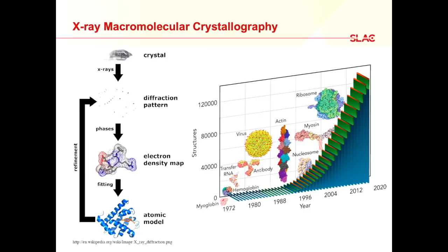This can be a tedious process, trying to take a protein and crystallize it. It does not always work out, but if you can do it, then you end up with one of those diffraction patterns with lots of these spots here, these intense spots of more intense light, more intense X-rays. Then we can deduce computationally where the electrons are from this pattern.